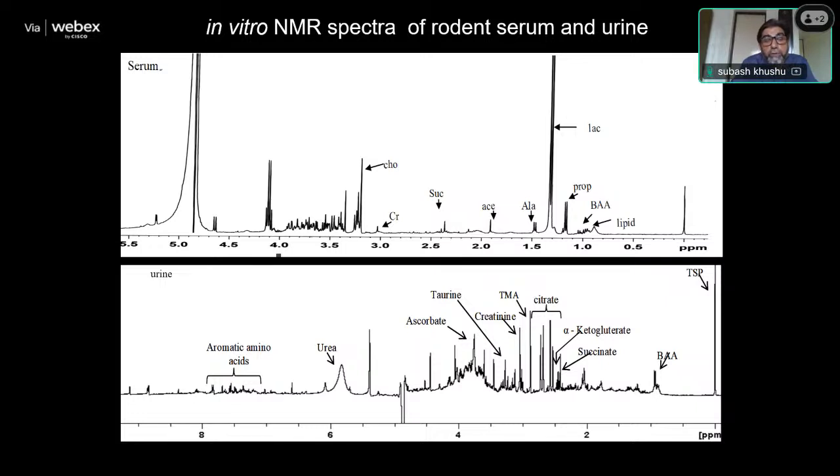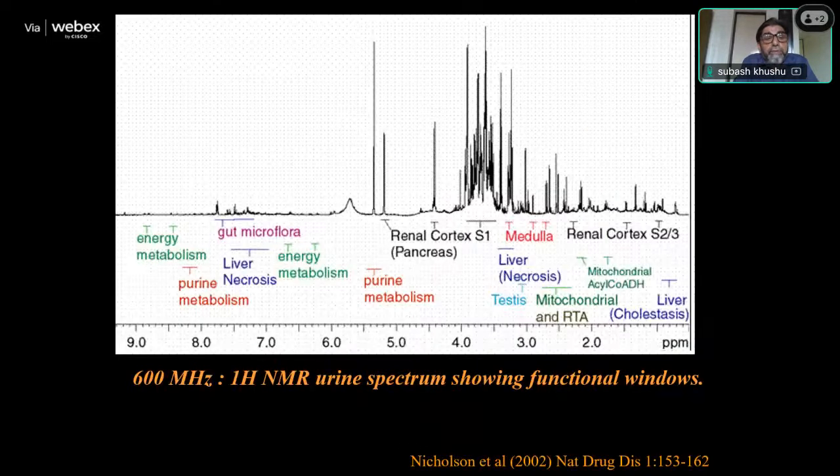It is always better to work with urine samples so that the subject or the volunteer can give urine of his own without waiting for the biomedical assistance to come. So we always preferred to use urine as a body fluid for this type of research. And this urine, as I told you earlier, has complete information about the functioning of the different organs and about the functioning of the human body.